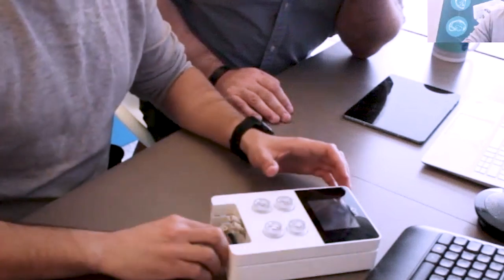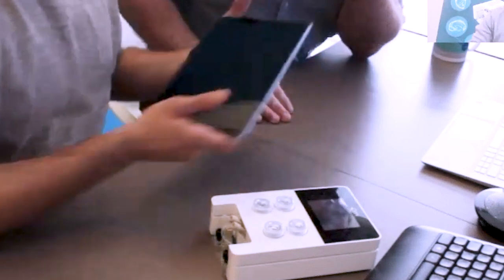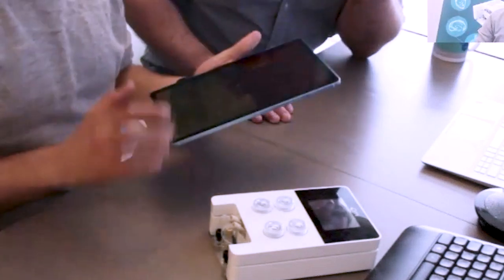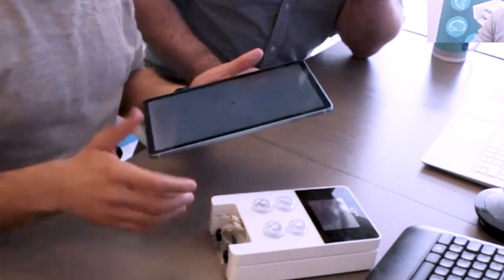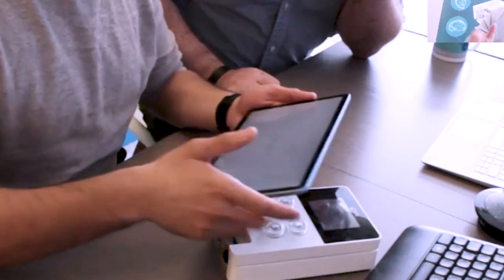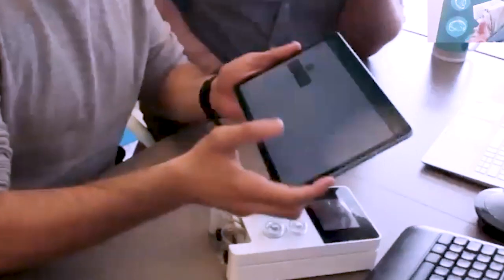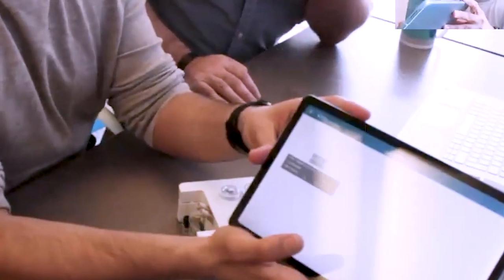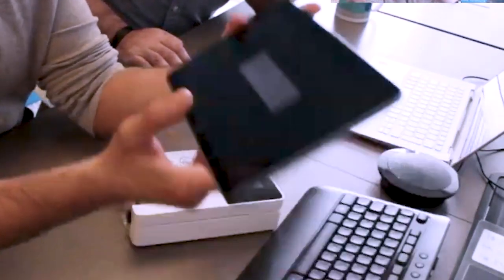And then here it's working. I have a tablet and I have already paired my OMI with my tablet. I will not go through all the demonstration to gain some time to answer the questions, but the idea is to present you a bit. So here I have a visualization on the tablet, on the application. I have my OMI here.